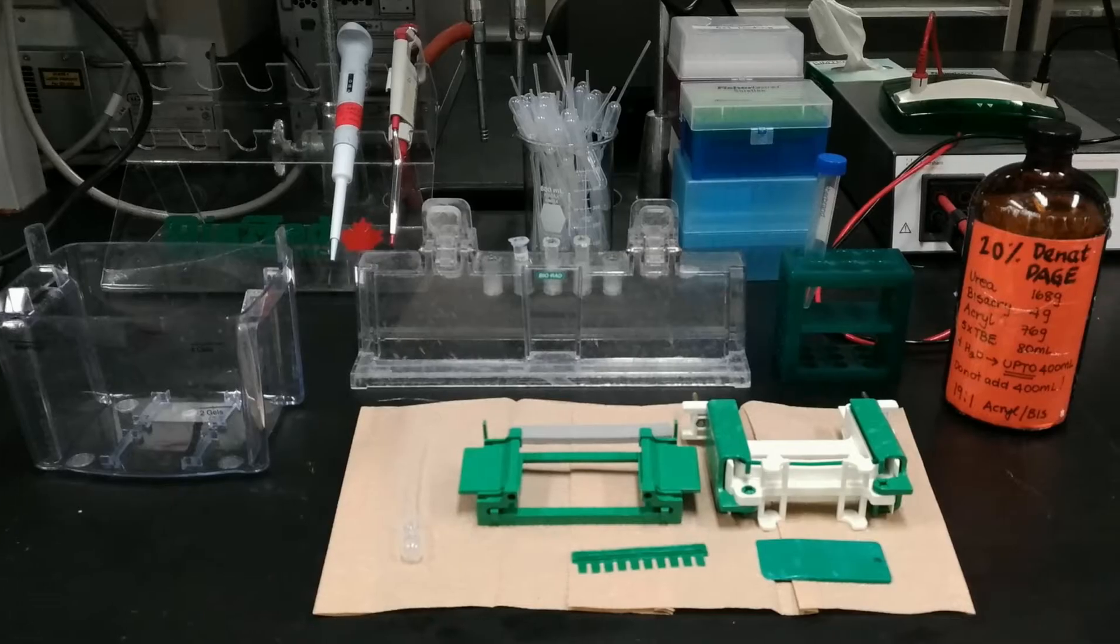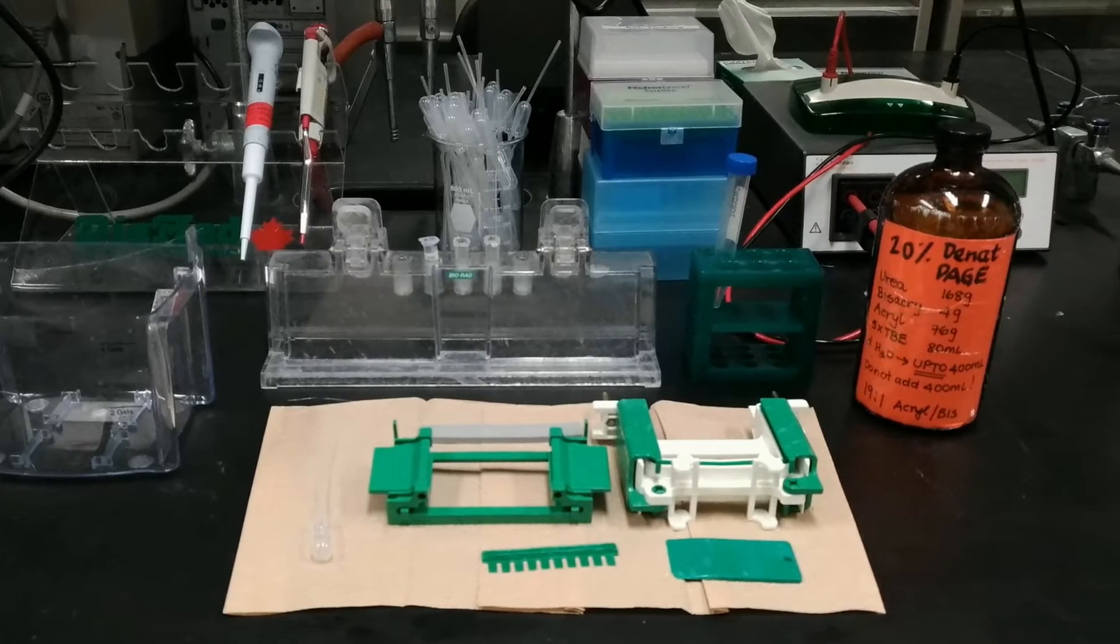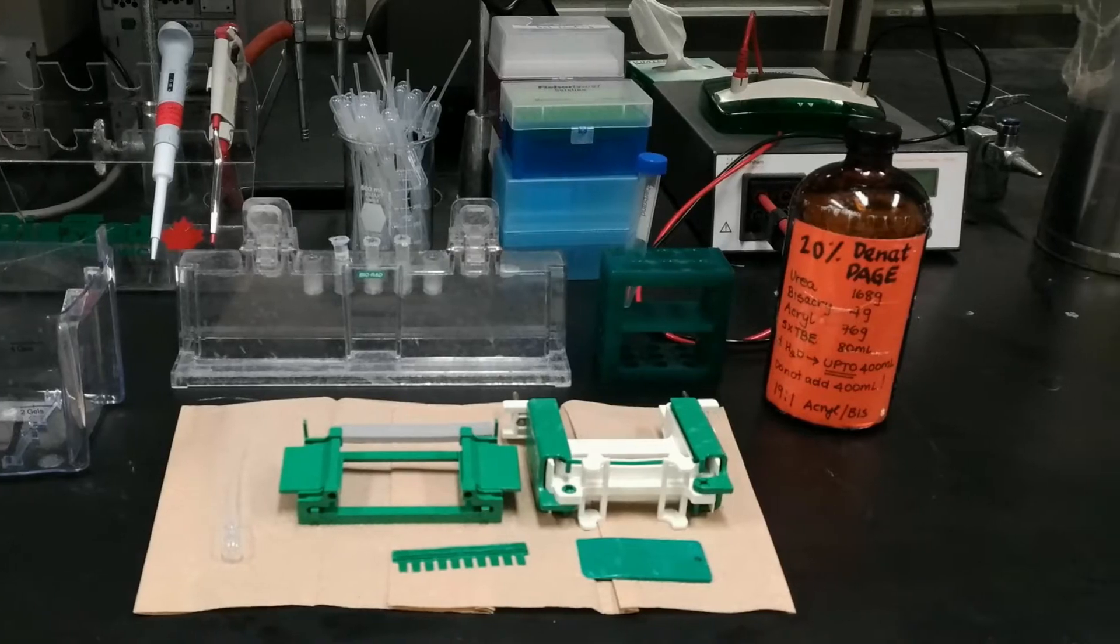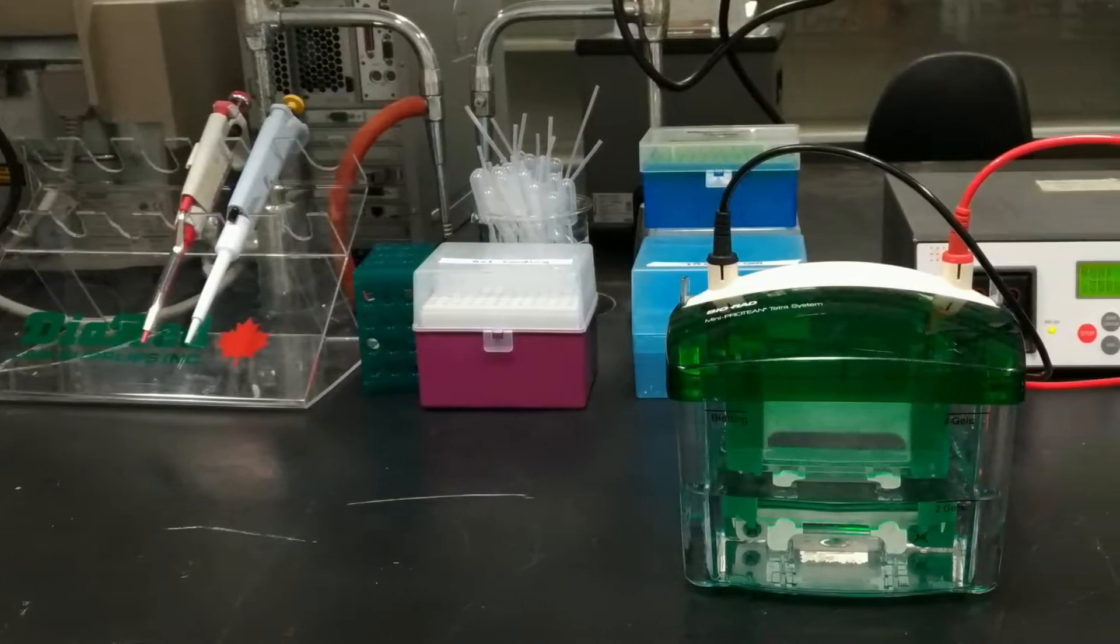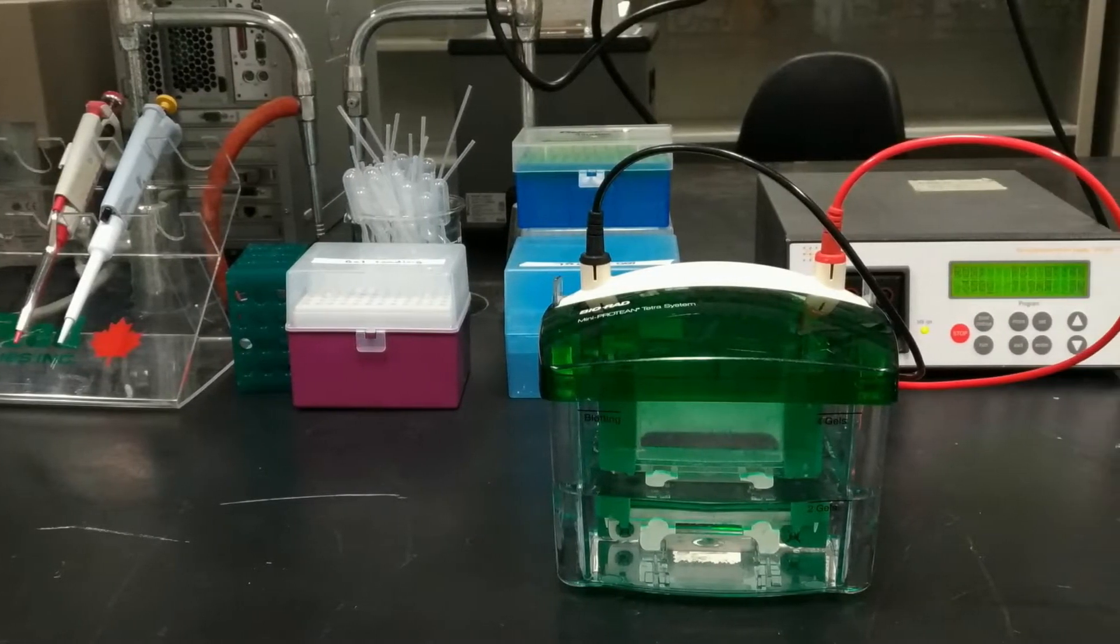Polyacrylamide gel electrophoresis, or PAGE, is a molecular technique that separates macromolecules such as proteins and nucleic acids based on their size by applying an electric field.